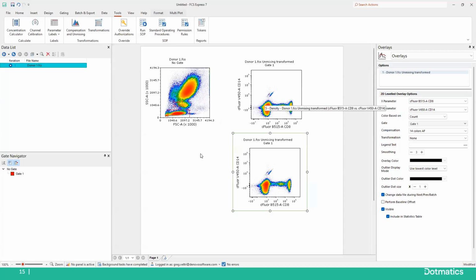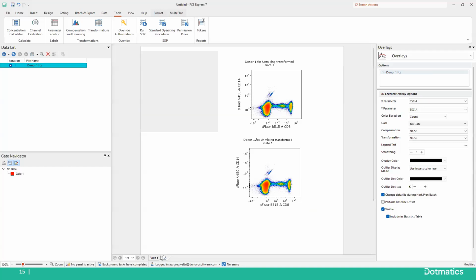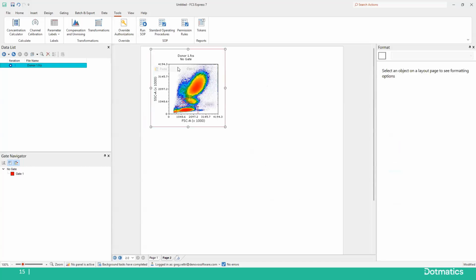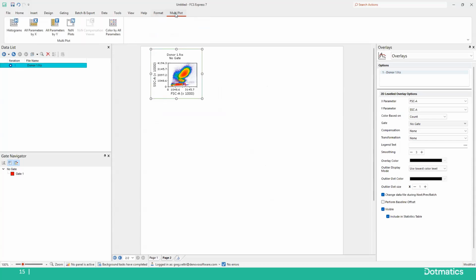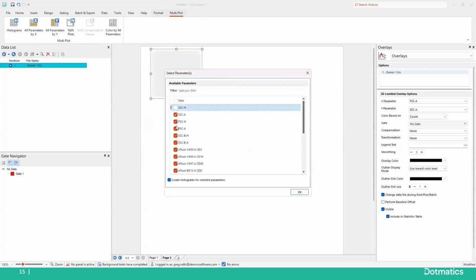All right. The other thing I want to mention that you can do, let me copy this and we'll go to another page. Let me just paste this here. Is n by n's. So I can select this plot and I will get a multi-plot right up here. And then I can do multiple types of n by n's, but I can do comparisons of how well it did.